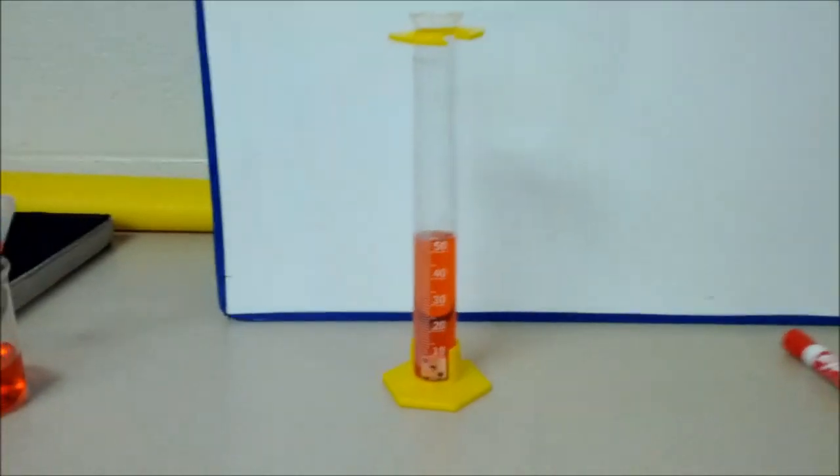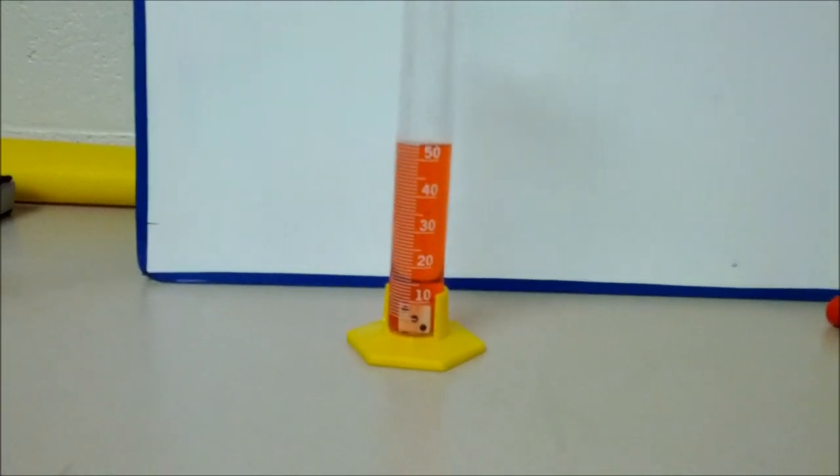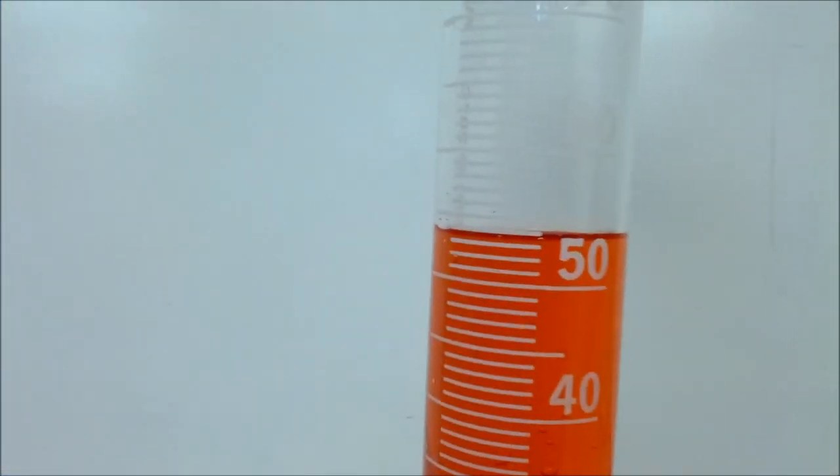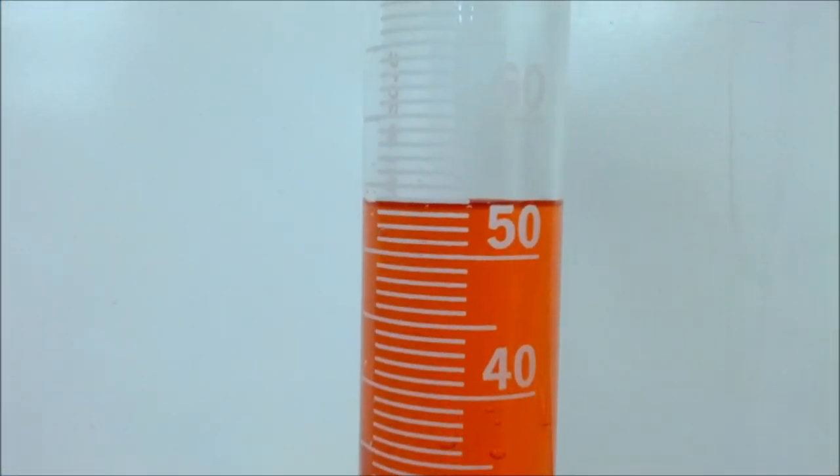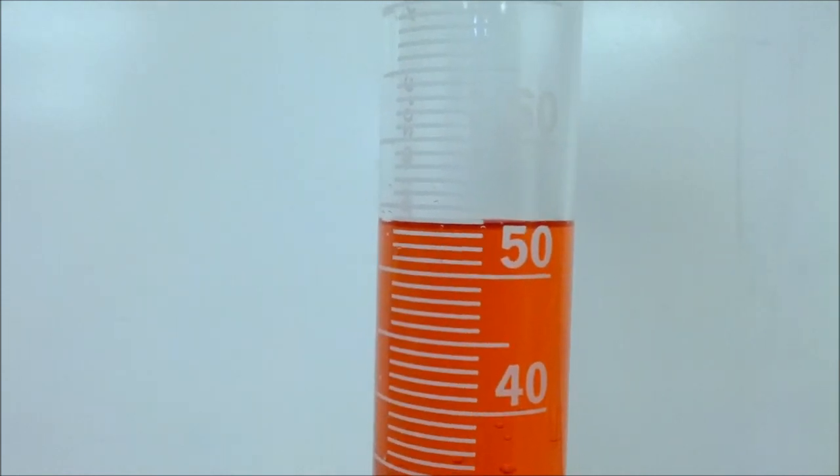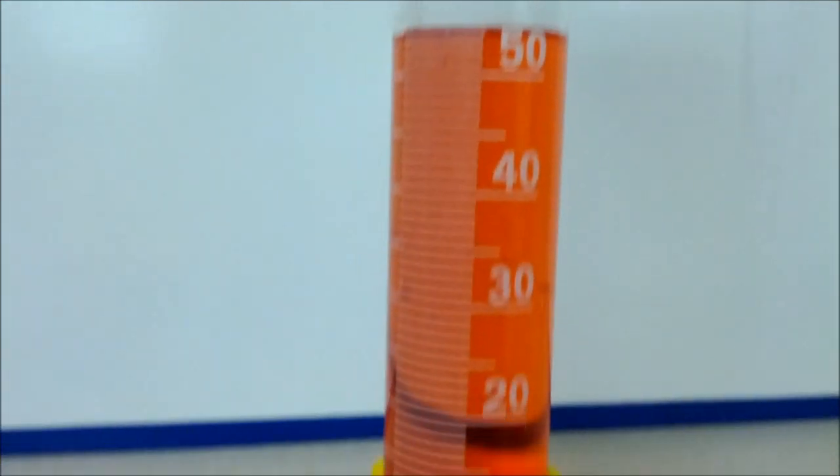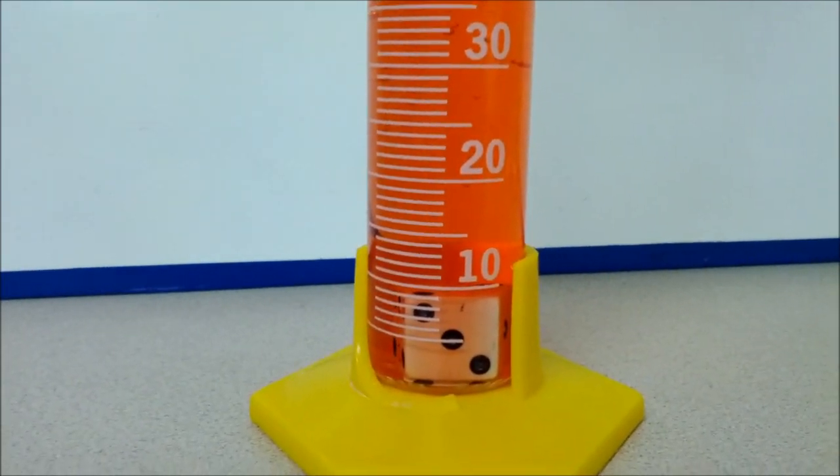Okay, so it was at 50. Now we've dropped in our number cube and we have to come over here and take a reading on our volume. It looks to me like the bottom of the meniscus is right at 53 milliliters.